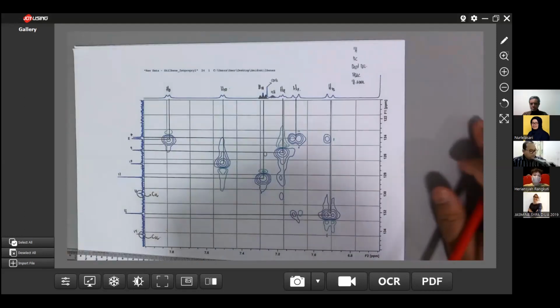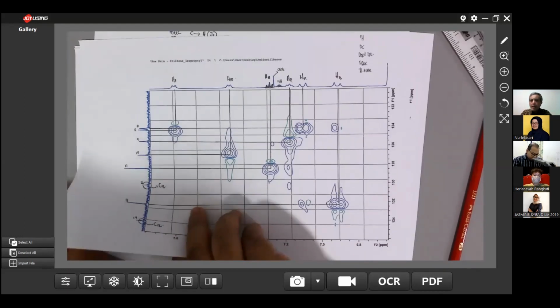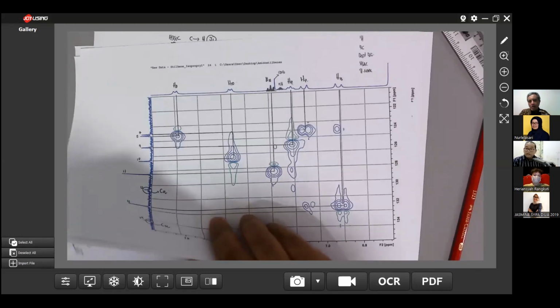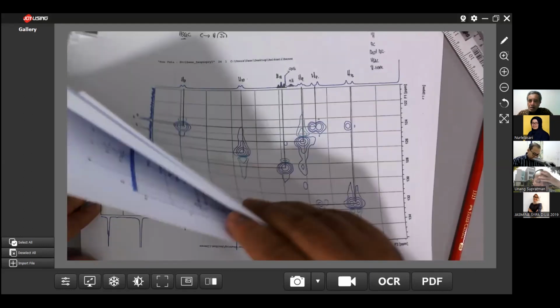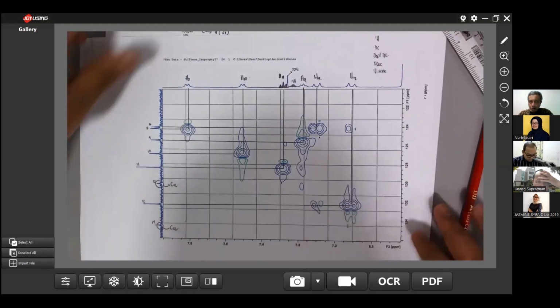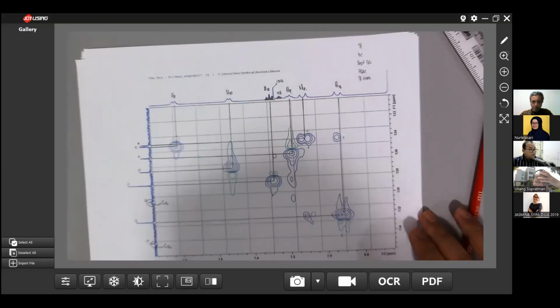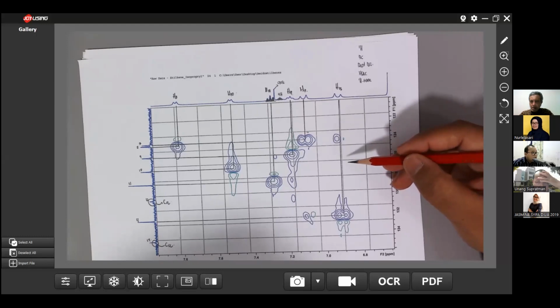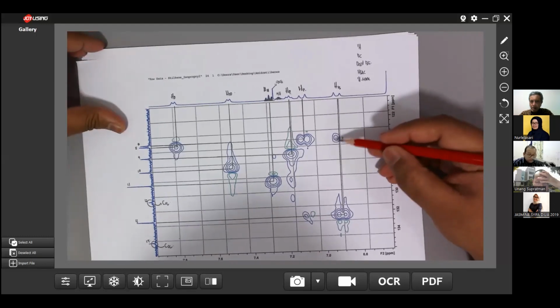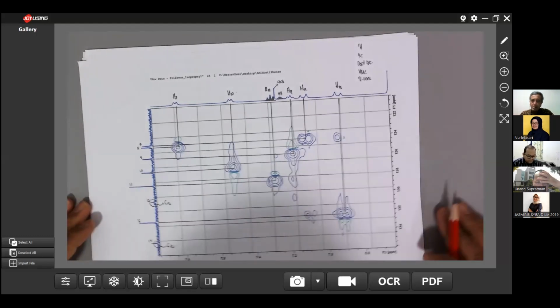So open the proton NMR. Where is the proton NMR? Ask me. May I ask you? Yes, Professor. There's a signal at 124 which correlates with carbon 7 here, which is H13. Is that the impurities or the satellite?